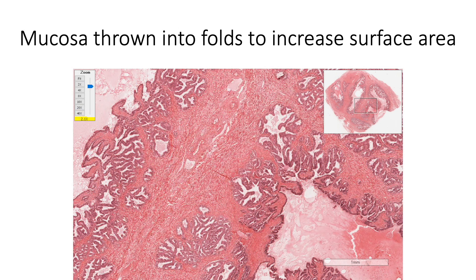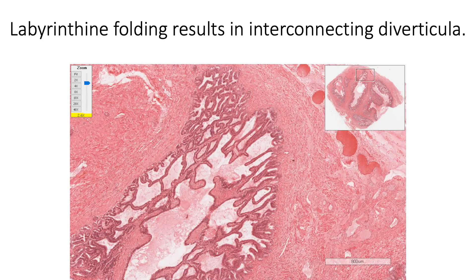The mucosa is thrown into primary, secondary, and tertiary mucosal folds to increase the surface area. Labyrinthine folding of this mucosa results in the lumen showing extensions appearing as irregular interconnecting diverticula of the lumen.